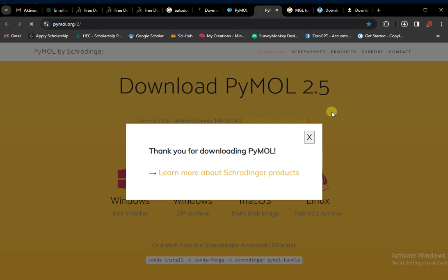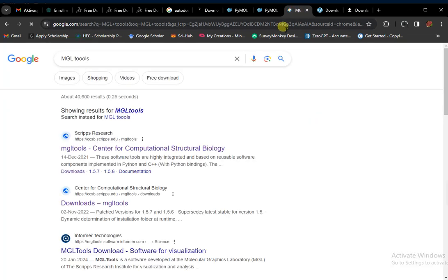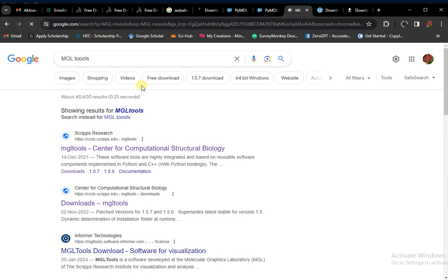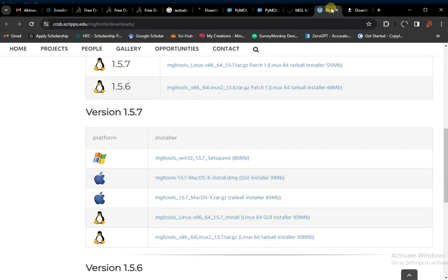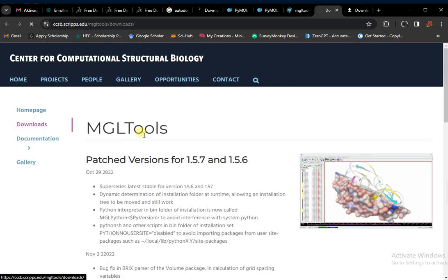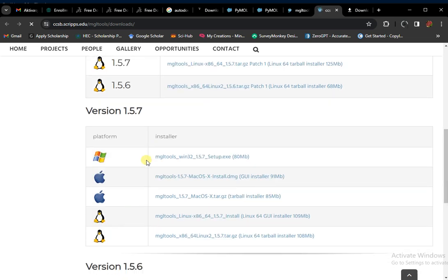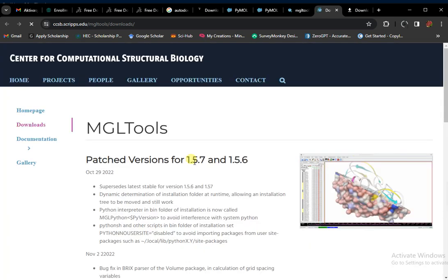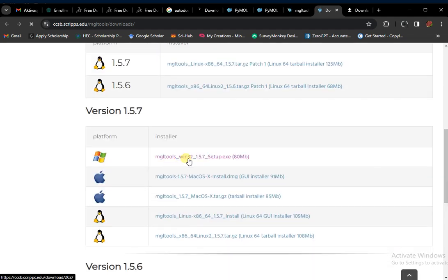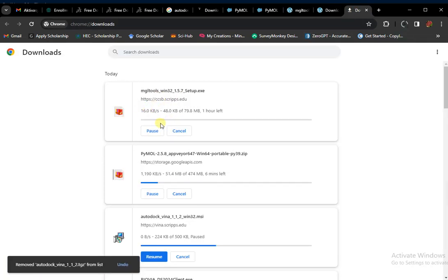The next software that is required and very important is MGL Tools. Simply type MGL Tools on Google and open the first website. Click on it and this type of website will open. From the Download section, download MGL Tools for Windows. Tap on it and a copy of MGL Tools will be downloaded. So all of these are now downloaded.